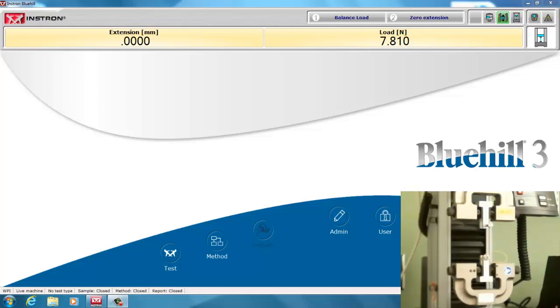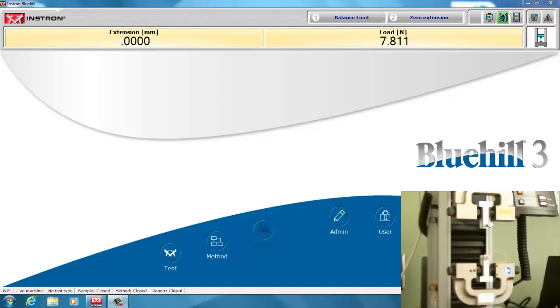Hello, this is Professor Billier at Worcester Polytechnic Institute, and I'm going to be talking about how to do a ring test, which is a specialized type of test for ring-shaped samples such as blood vessels, and could commonly be done on blood vessel replacement grafts. It's a functional measure not really used for intrinsic strength properties.